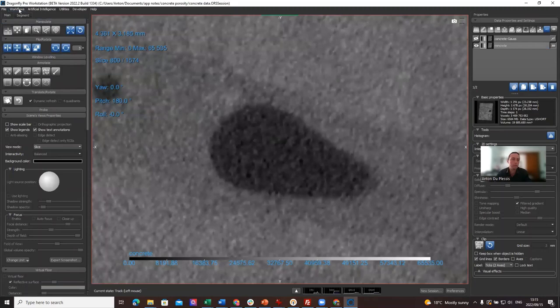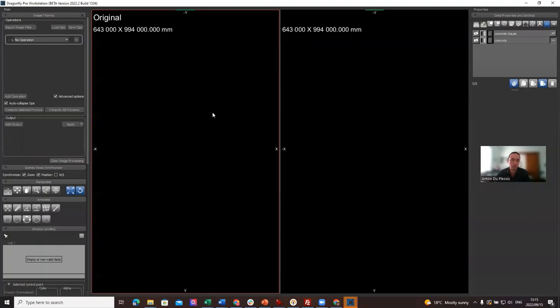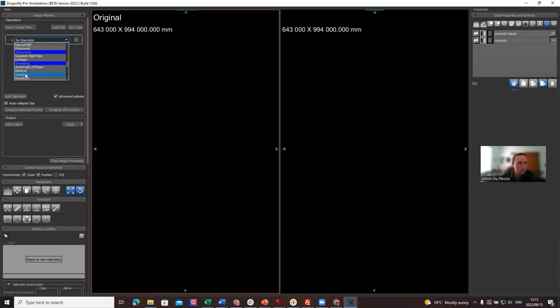How we reach that state—I've already done it here—we go to Workflows, Image Filtering Toolbox. This is a very powerful toolbox which you can use. For example, we can use a Gaussian filter. There are all kinds of image processing tools here, but the smoothing tools are of interest, Gaussian in particular.